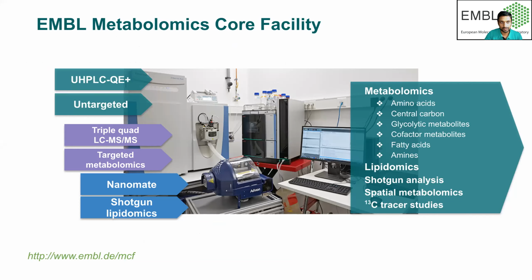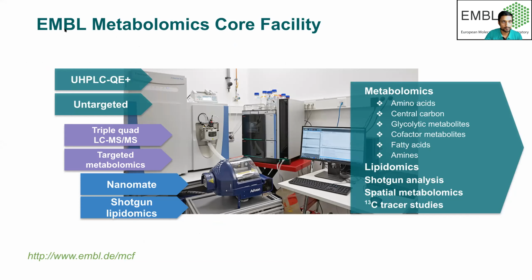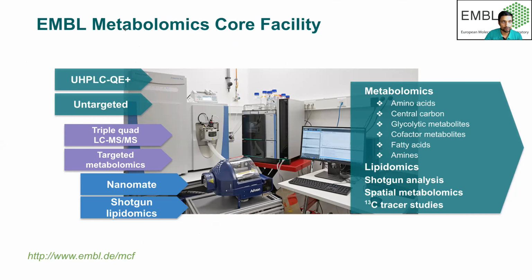And then we have this NanoMate. This NanoMate is another tool which we use for generating direct analysis data. This is the blue Advion instrument you see.